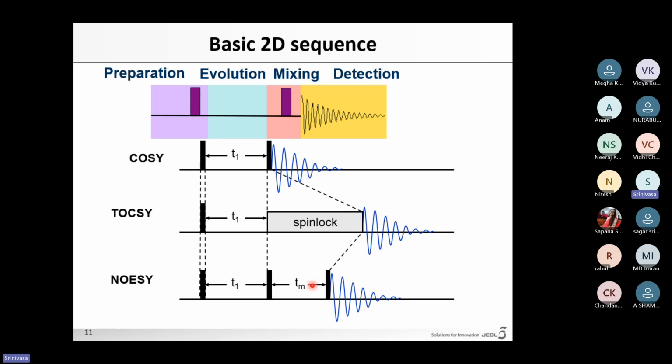It depends on the number of scans and the T1 increment, ma'am. In the experiment, you can see the T1 increment and the number of scan repetitions. If you keep the same T1 increment as the Bruker system the user is using, and the same number of scans, the experiment time becomes exactly the same. Whatever template we have created in your system is based on a generalized template, with more scans and more T1 increments, so the experiment time is more.